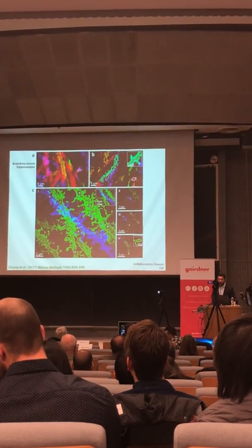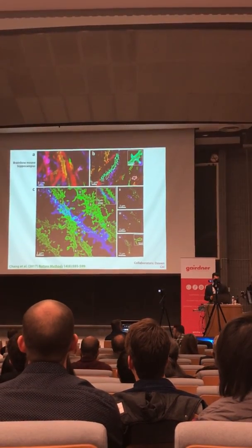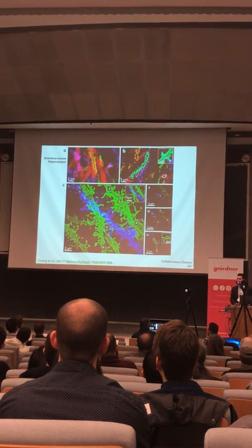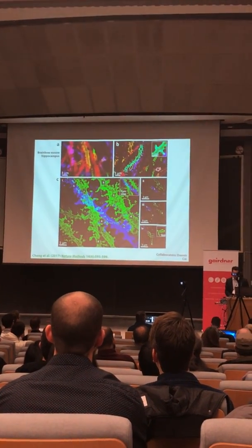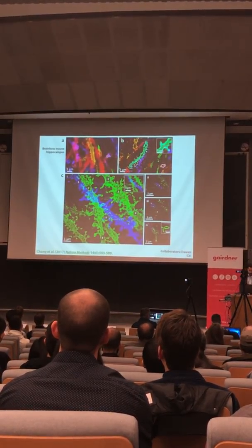And so this is very exciting to us because now we and others have characterized this protocol, and we think that we might be having a resolution now that is equal to or comparable to any other nanoscale resolution imaging strategy out there using light microscopy.